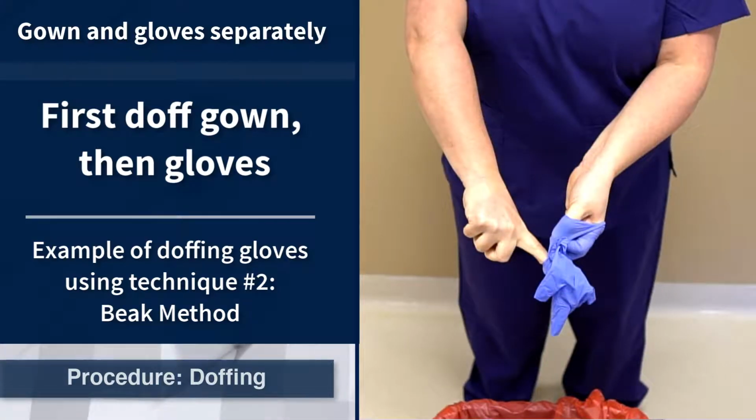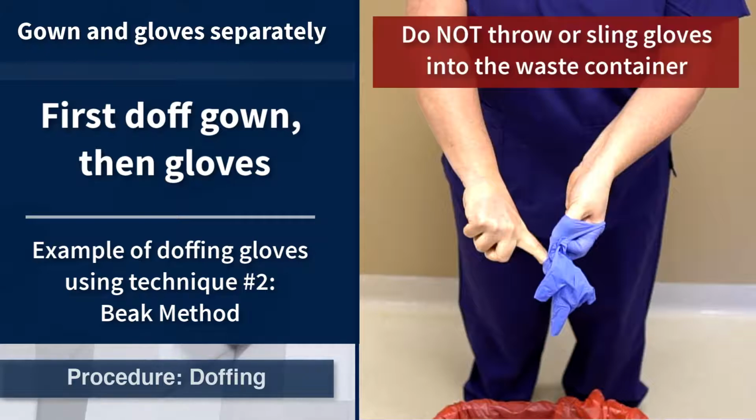After the gloves are removed, dispose of them safely. Do not throw or sling gloves into the trash.